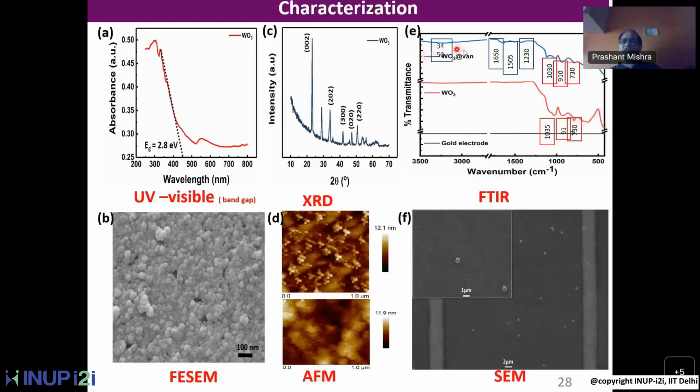And then you can also look at whether the vancomycin, which is important for making a specific sensor, has been deposited over there or not. So you look at those wave numbers and you can compare that, okay, this corresponds to the vancomycin, and that's why they have been quoted. And this discrimination should occur between the gold electrode, the material which you have deposited, and then the sensing element which has been changed because of the biological material.